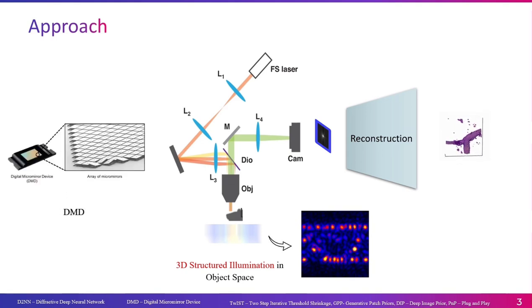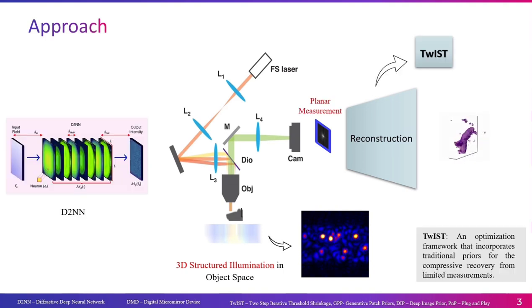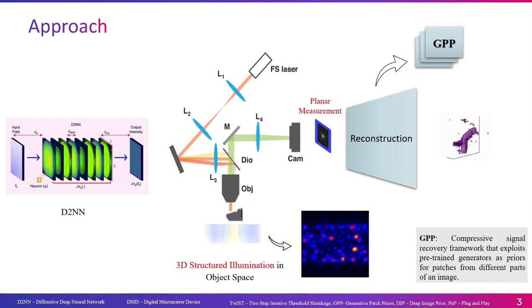The proposed framework comprises three key components arranged sequentially to address the inherent challenges. Firstly, at the forefront of the framework lies the forward imaging model designed to capture depth resolution within the microscopic specimens. This component serves as the foundation, ensuring the faithful representation of 3D structures onto planar detectors.